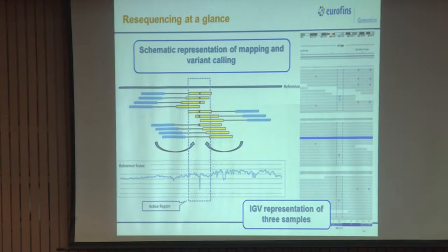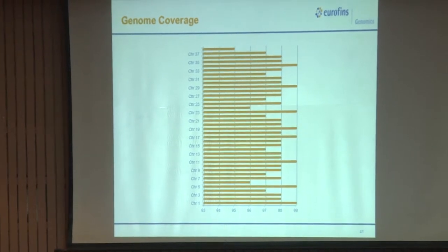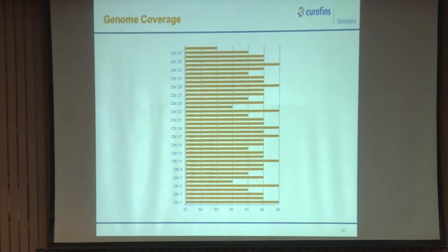So that is where genome coverage comes in. If we have it chromosome-wise, we can identify genome coverage chromosome by chromosome. If I only have one chromosome, I can identify how much is my genome coverage based on calculating the ATGC against the N's. The more N's, the lesser the percentage of coverage. That means that region I could not cover with the resequencing.